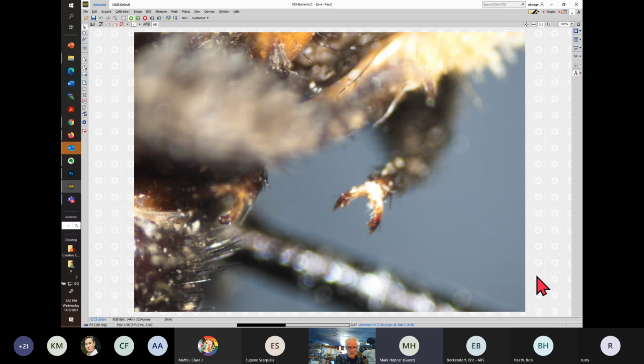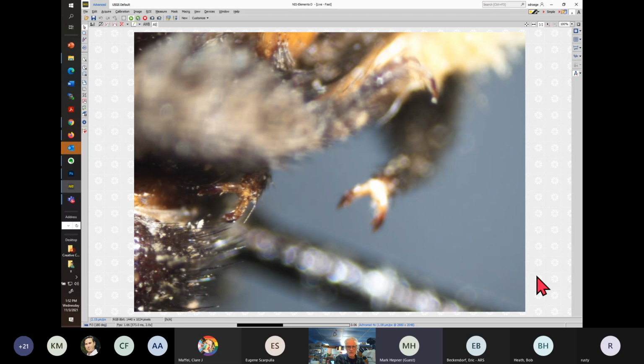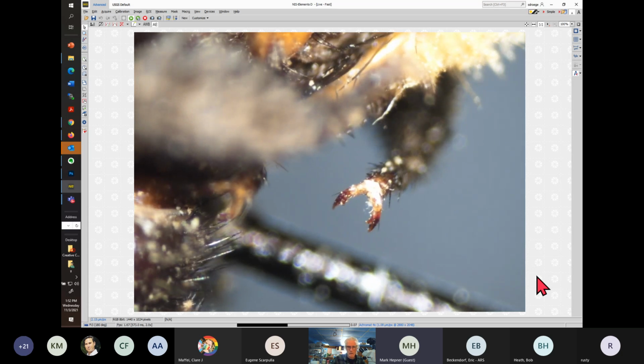Having some refresh issues. Oh, okay. So again, at this level, I can't quite tell, so we're going to probably skip it. It might have an arolium, but a small one there. Let's jump right to the guide and start in on it.